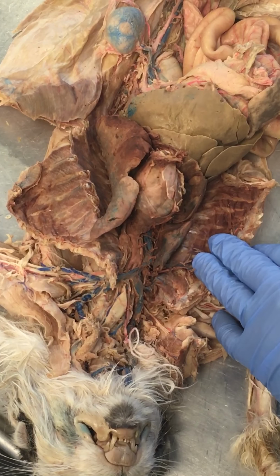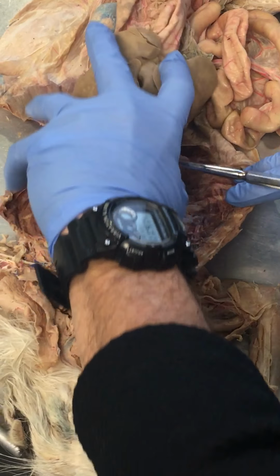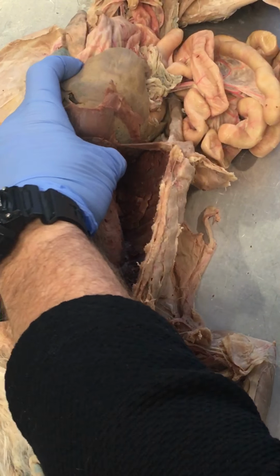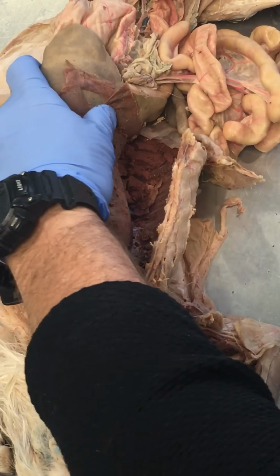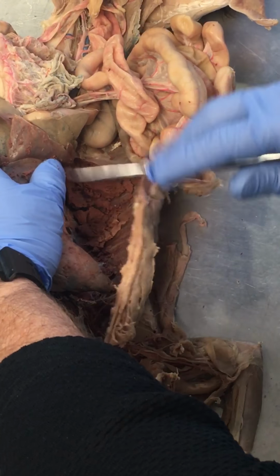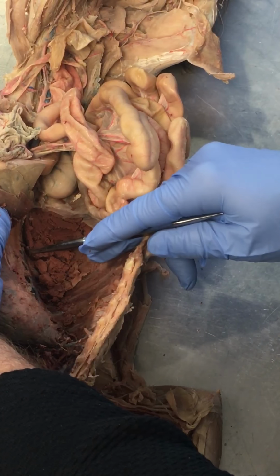All right, now we want to talk about azygous. Did you guys do azygous vein? No. Oh yeah, you did. Good. All right. Here's that scissors again. We're going to cut the diaphragm so we can pull some of these muscles away, and we can lift this up so you can see. So azygous vein is that dude right there. By the way, this is just dried blood. This is all dried blood here, but this is azygous vein coming along the right side.